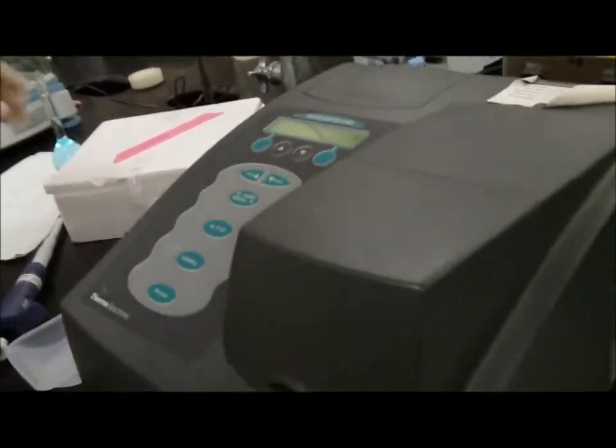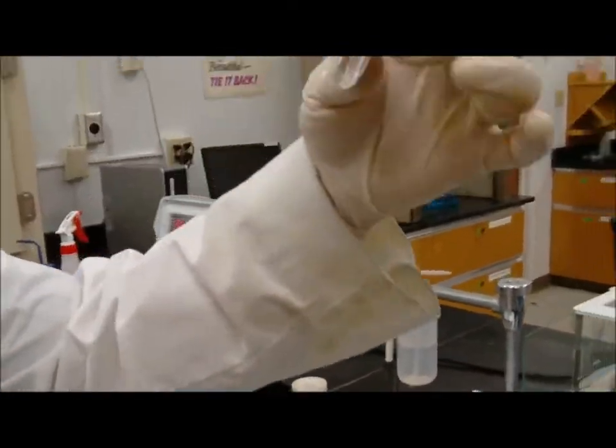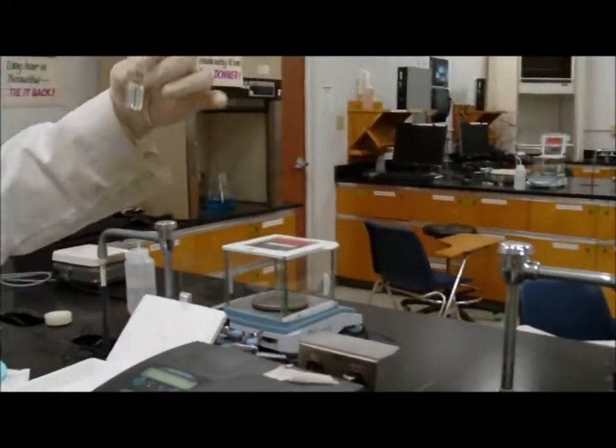Now, I get a cuvette out. My cuvette is going to first contain water, so I can blank my spectrophotometer at that value. So there I have my blank.